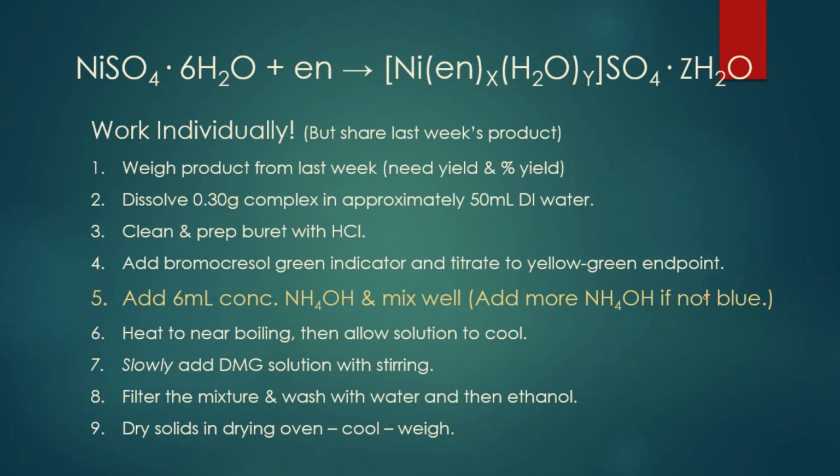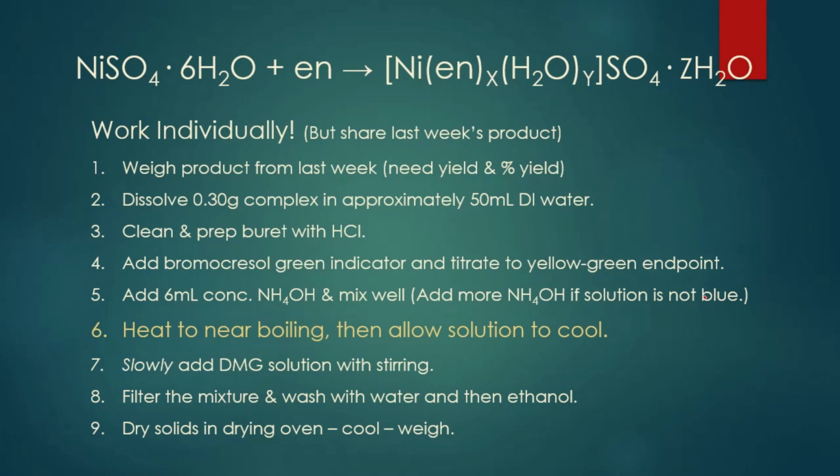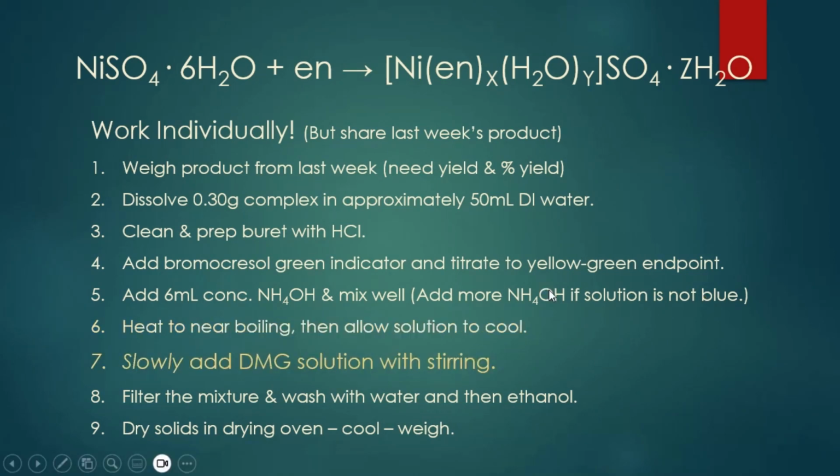But the concentrated stuff will clear your sinuses, it will burn your throat, your eyes will run. It's not pleasant stuff, so measure it out in the hood, add it, and then take it back to your workspace. Then we're going to heat it to get it nice and hot. It doesn't have to be all the way to boiling, but you want to get it hot. This ensures that we're isolating that nickel so that when we add the DMG, it's going to precipitate.